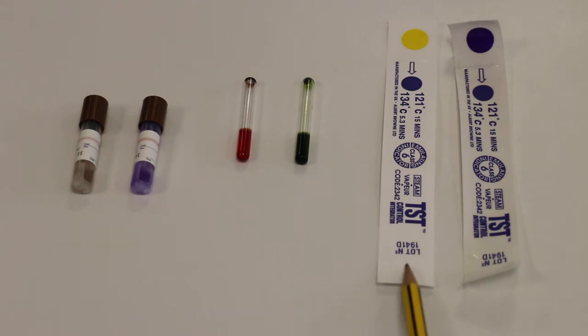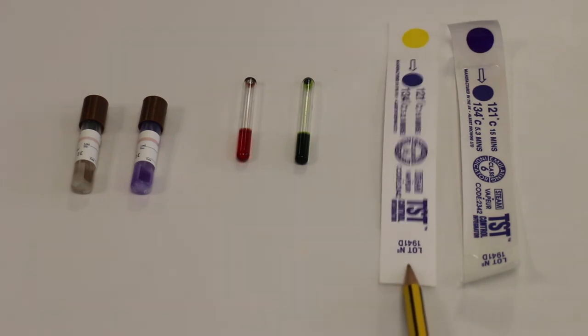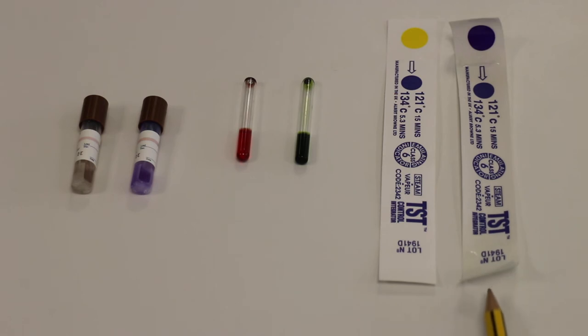For the paper strip, this was what it looked like before we put it in the autoclave and this was what it was like when it came out the other end. You can see the color of this circle has changed from yellow to blue, indicating that the autoclave has got up to temperature.